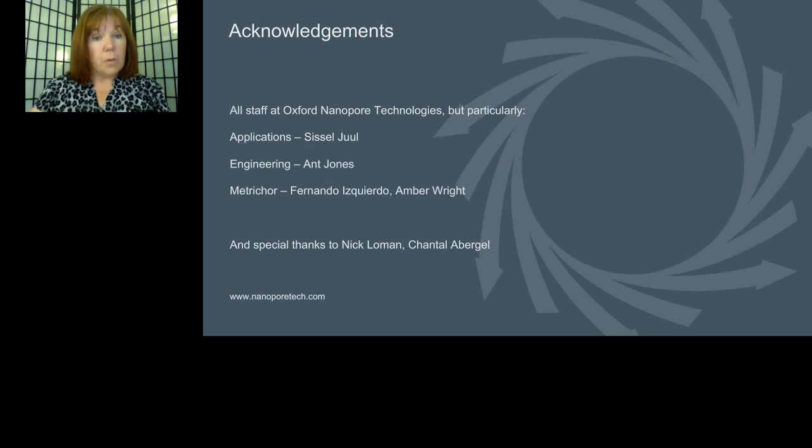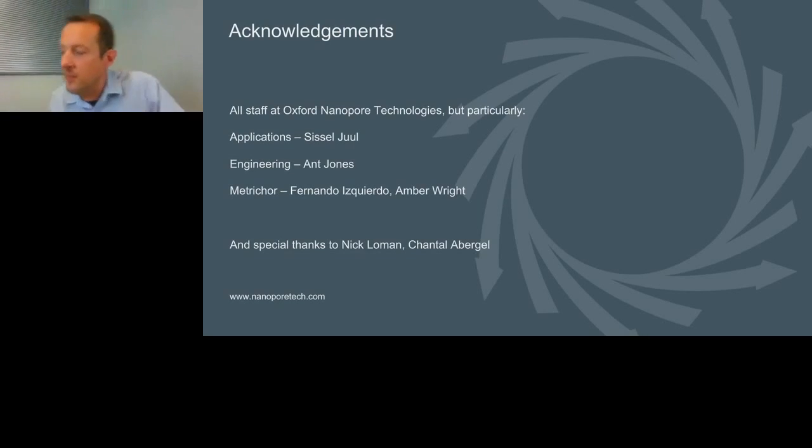Now, our first question. You mentioned that WIMP is quantitative. Does that mean that all MinION sequencing is quantitative? It depends how you go about setting up the sequencing reaction, I suppose. I wouldn't claim that anything that has an amplification step in it could be remotely quantitative.